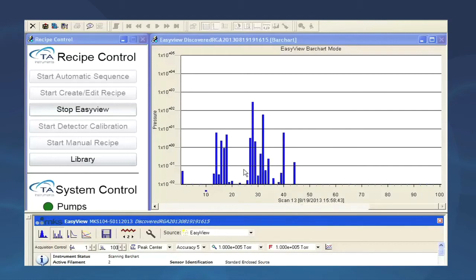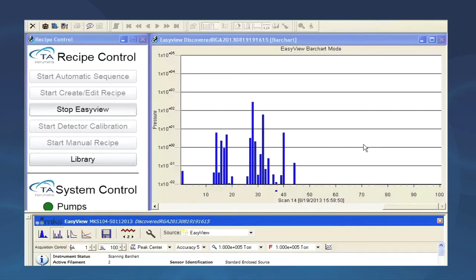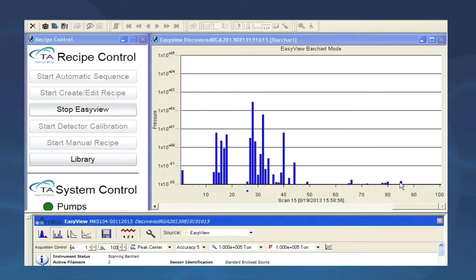What we see is the background atmosphere as the furnace is open to the air. What is most important is that there are no ions being detected above 50 atomic mass units or Daltons. These ions would likely be associated with contamination from previous experiments indicating that the instrument or possibly the TGA needs cleaning or a bake-out.